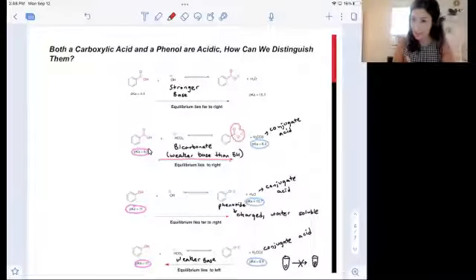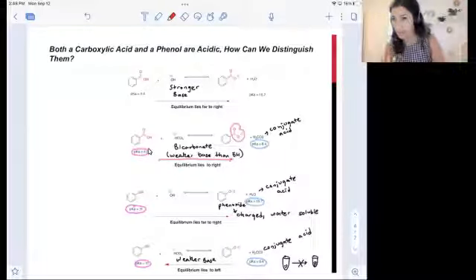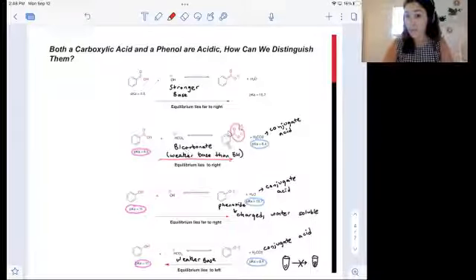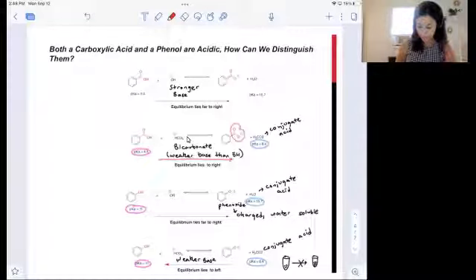So I am again using the stronger acid to form a weaker acid. This is thus a right-lying, favorable equilibrium. So if my molecules contain carboxylic acid functional groups, I would expect to observe solubility when treated with aqueous bicarbonate. So again, looking for a fairly clear solution, single layer.